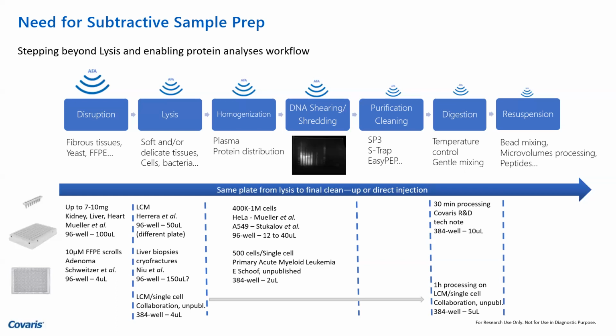But typically, mass specs are very good, very specific, very selective, right? But they can't handle a big molecule. It's not your sequencers, not your PCRs. You cannot amplify a protein, by the way. So when you work with mass specs, you have got a gigantic protein. The molecular weight is what, 150 kD, if not higher. And your mass spec can only see this much at a time. Your mass spec can see 1,000, 1,200 Dalton at a time, and not more than that. What do you do with that big protein? You cut it into smaller pieces.